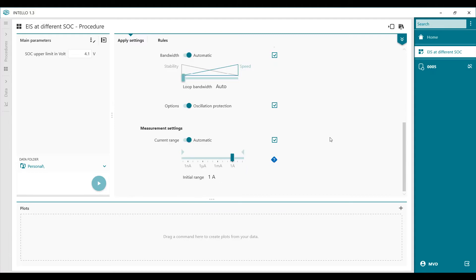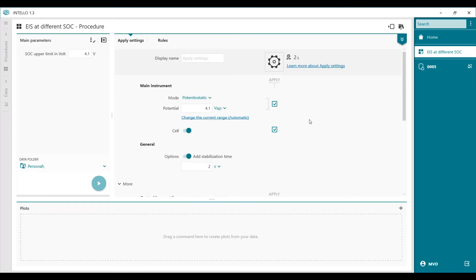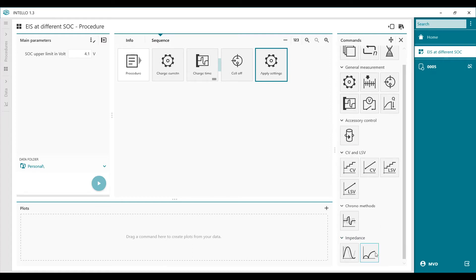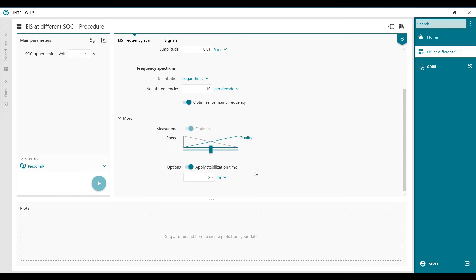We start with 1 amp current range because we also left at 1 amp. After this is applied, we drag and drop an impedance frequency scan. We define the frequencies from 10 kHz to 10 Hz — this is just to speed up the process, but you can go to lower frequencies of course. We optimize for the main frequencies and we can also apply a stabilization time.